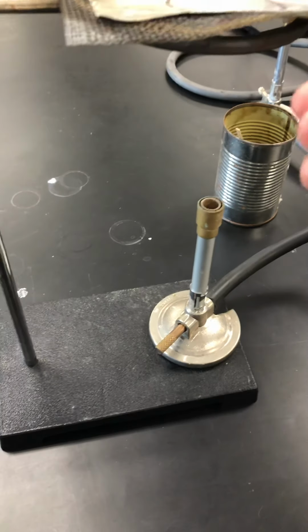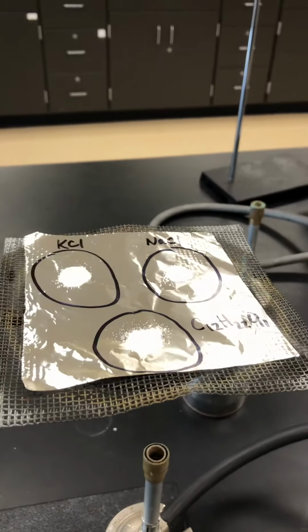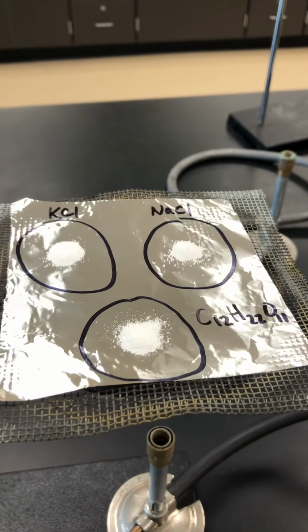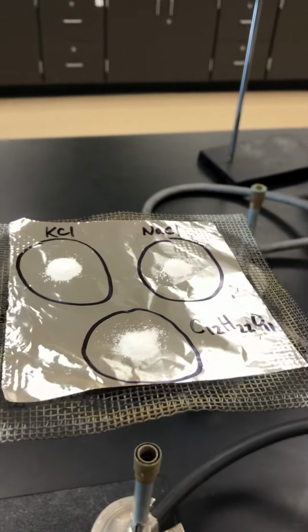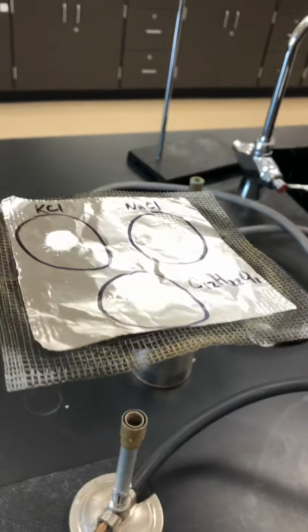So I'm going to put that over the Bunsen burner. And then what I'm checking to see is how soon each of them melt to determine if their melting points are high or low. So I'm doing this with one hand because I'm holding the phone. So just bear with me for a second while I get this started up.